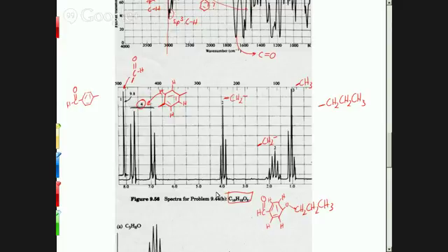No, because it can be anything that has something. That's right, but that doesn't necessarily mean that your carbon is connected directly to it. You don't even really use this except for a general idea. Try to find those pieces, and let the pieces be. That's a better way to do it. So looking at the spectrum, say, okay, this is a 3-hydrogen group, so that means a CH3. So what might that CH3 then connect to? So when you get the 3 or so different parts, then you can put those pieces together and see how they fit.